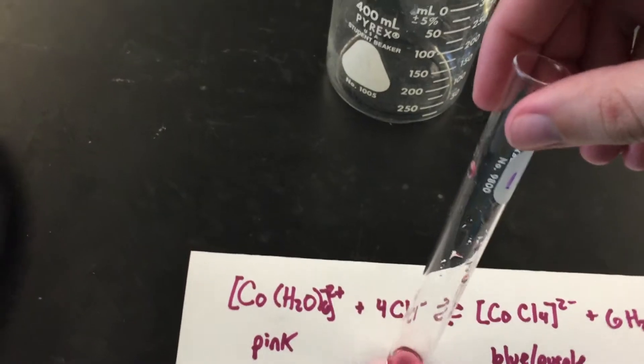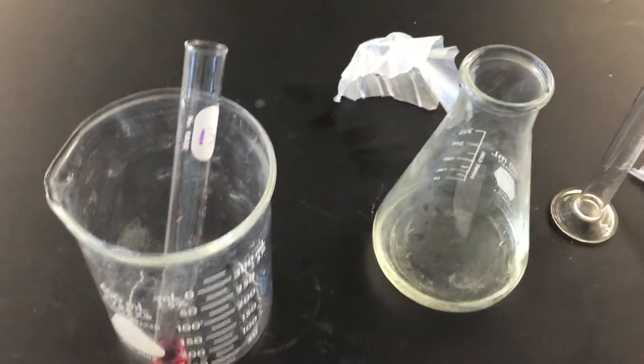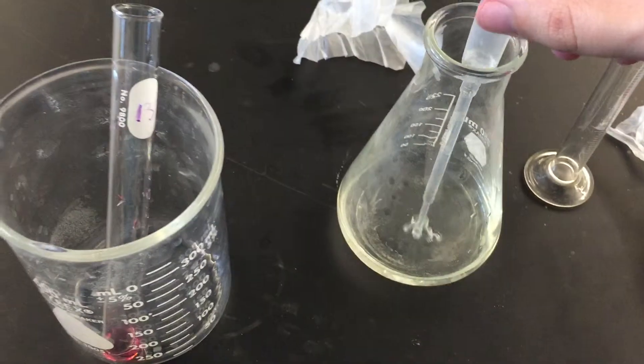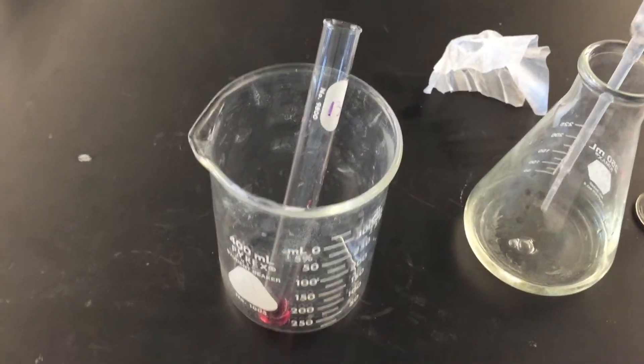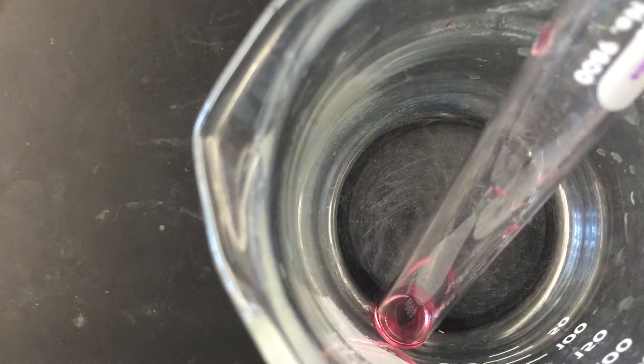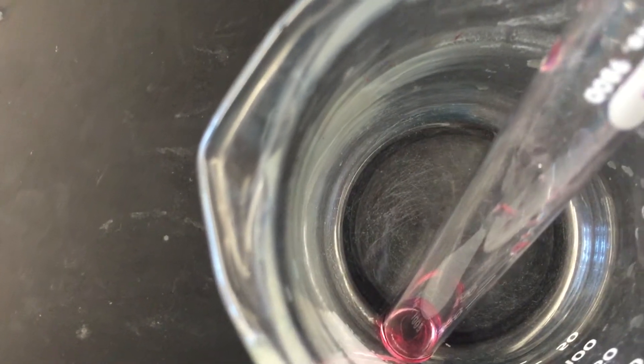What I'm going to do is add more Cl-. I'm going to use hydrochloric acid as my source of Cl-. Let's take a look inside our test tube while I add HCl.